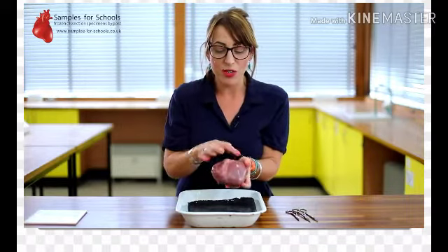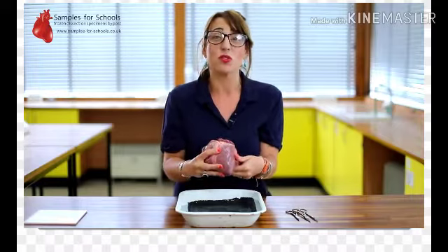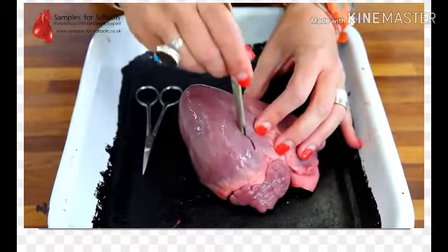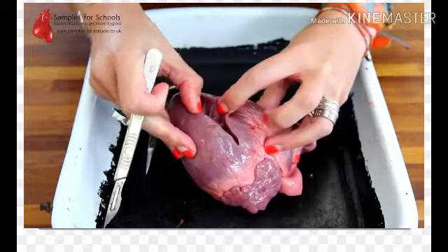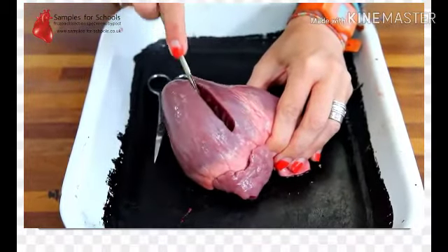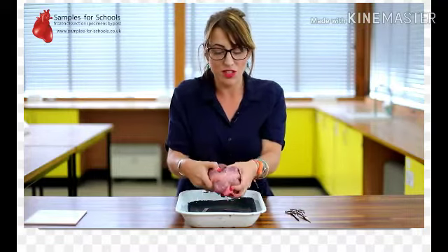When we make this incision in here, we're going to be cutting into the most muscular part of the heart, which is the left ventricle. And the left side pumps blood around the entire body out of the blood vessel called the aorta. So our first incision will be parallel to the coronary artery, straight through the muscle. You can see as you start to cut it open, it's thick muscle tissue, so it may need more than one cut. And you can see the depth of the ventricle there. Incredibly thick, firm, muscular piece of tissue.